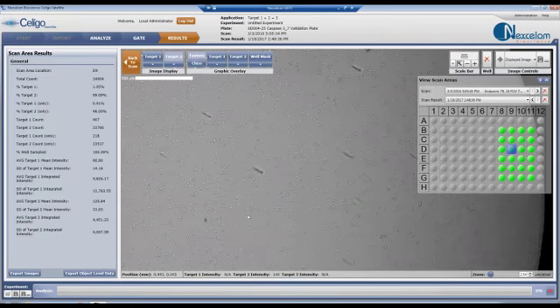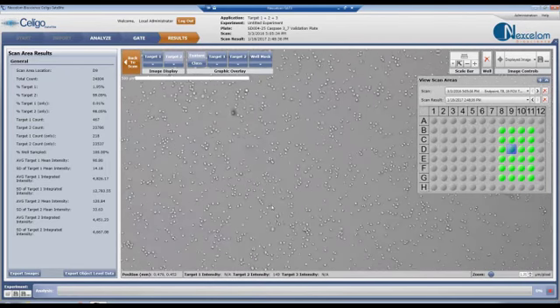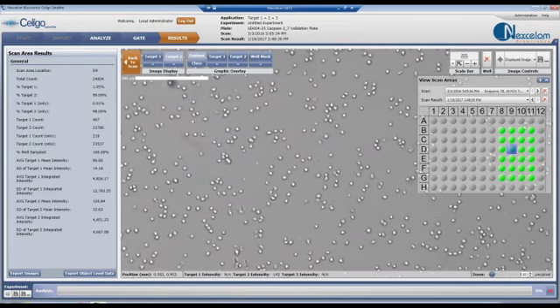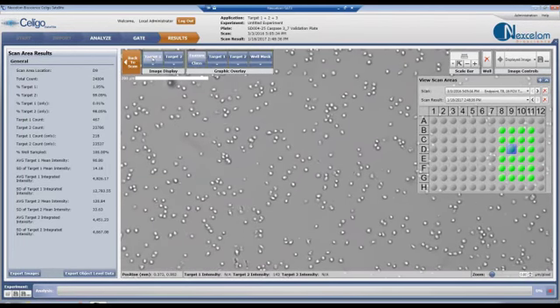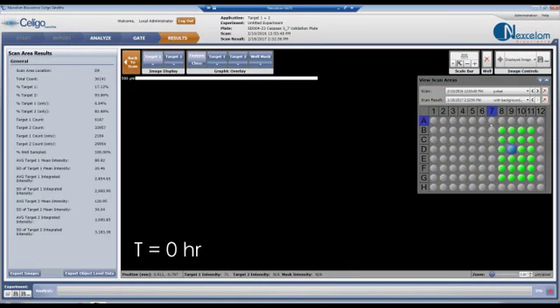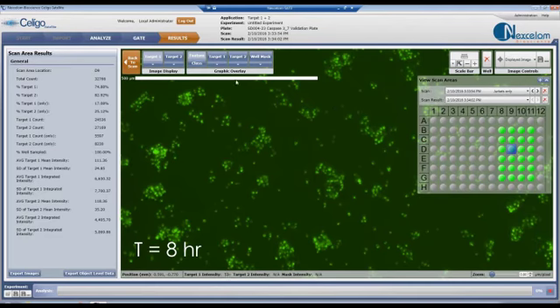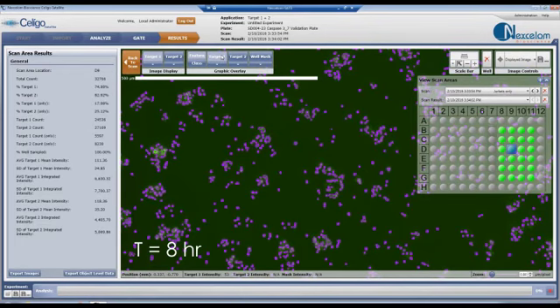We can zoom in to look at the cell morphology in the brightfield image and examine the staining of caspase-positive cells. By using the drop-down menu, we can quickly look at and compare samples captured at different time points. Direct cell counting of caspase-positive cells allows for the real-time monitoring of apoptotic events on a per-well basis.